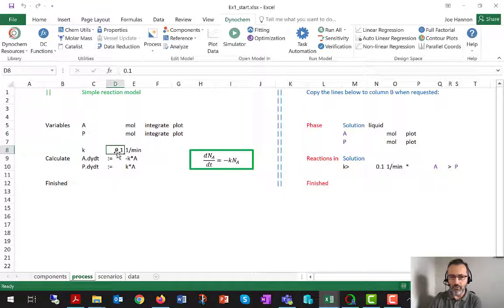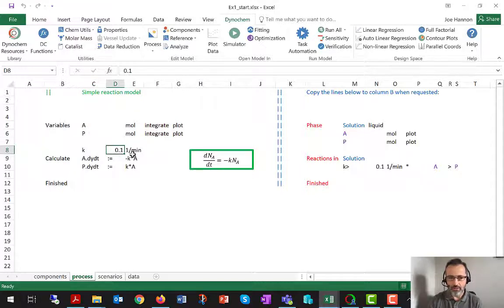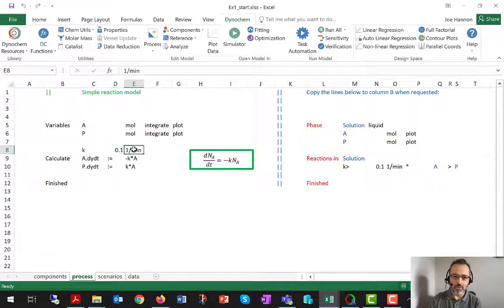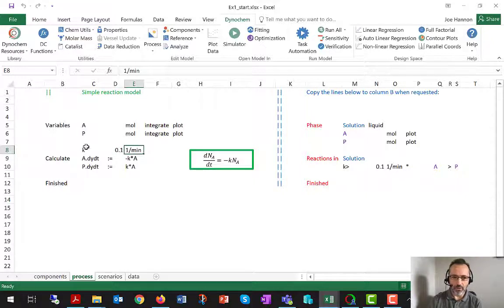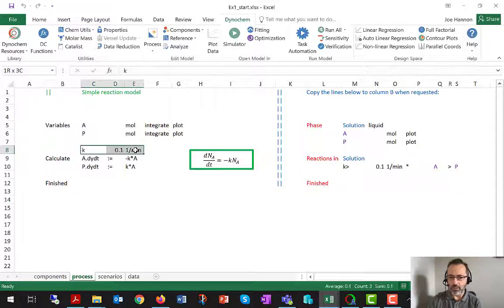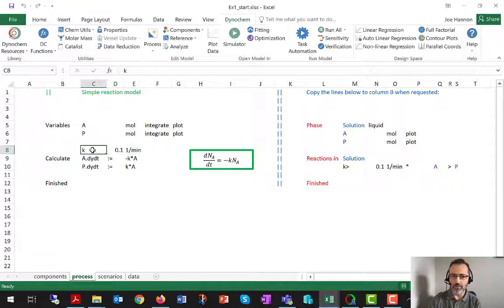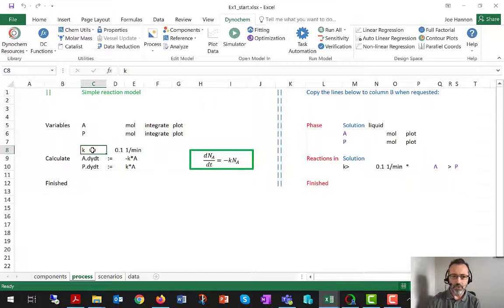So here we have given a value because we're going to dictate 0.1 reciprocal minutes, and that's absolutely fine. We're not going to be solving or integrating an equation for the rate constant. It's more like a parameter that we need to solve the rate equation.